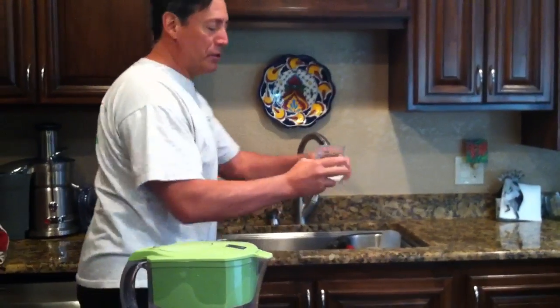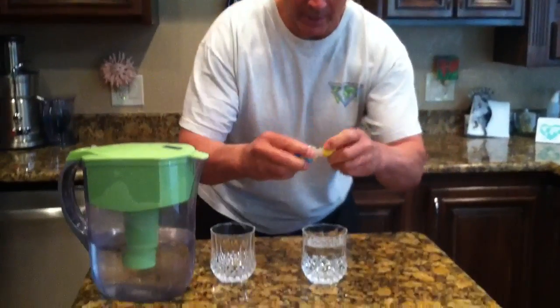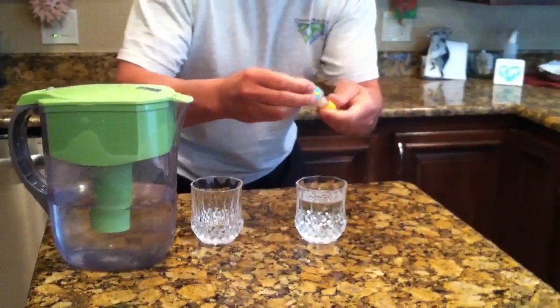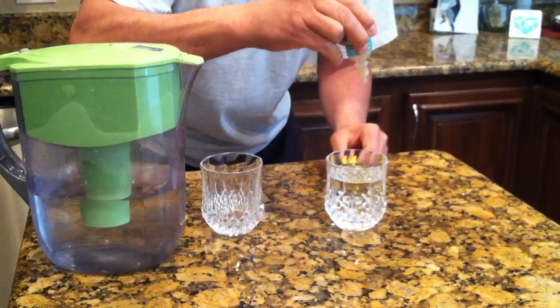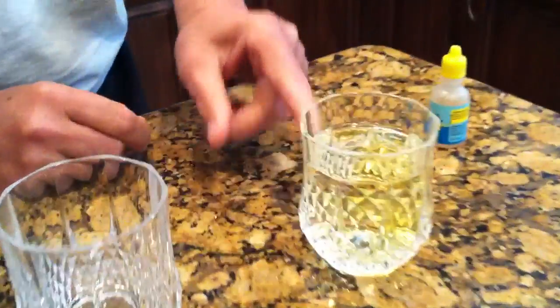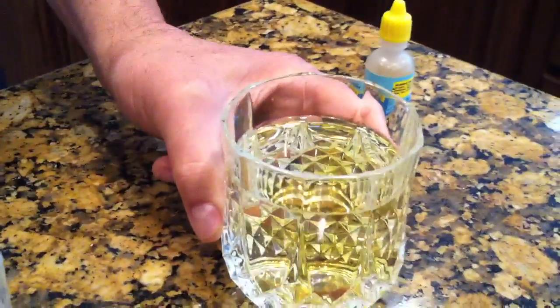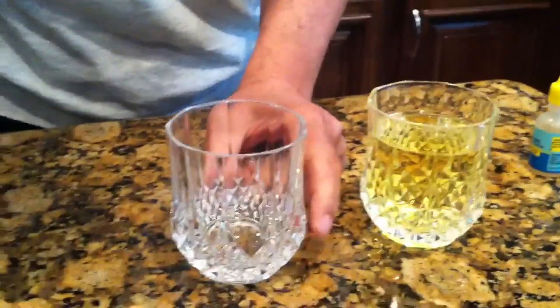You watched me pour that water from the tap. Now I'm going to pour these drops in — one, two, three, four, five drops — and you can already see it turning color, turning yellow. You see the yellow? Now I'm going to pour water from this filtered pitcher.